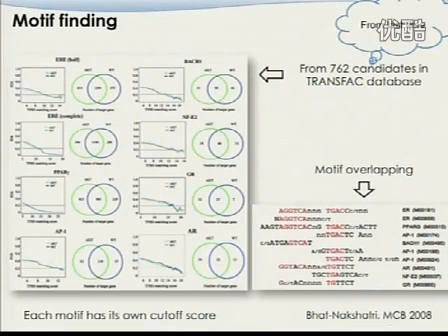Okay? So last time, what we really talked about were the peak finders, the analysis specific to transcription factor binding, and also motif finding. Those are the two things we talked about. Any questions so far?